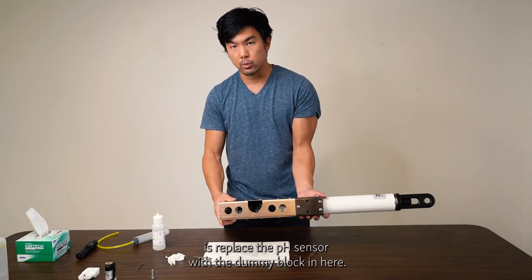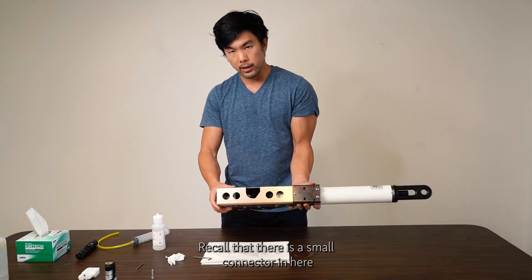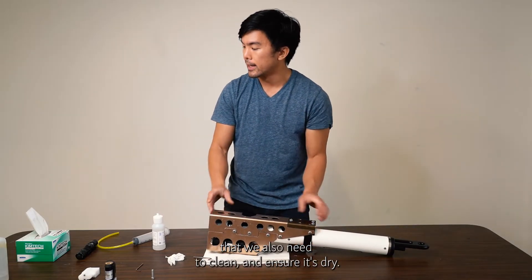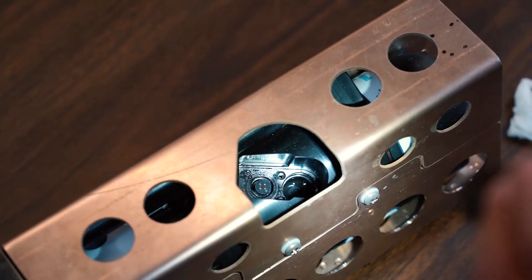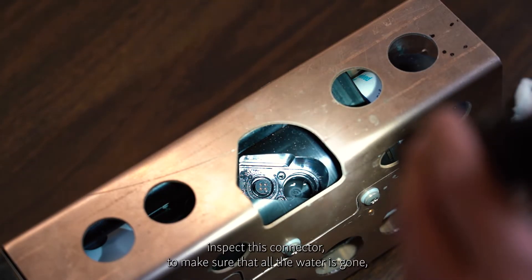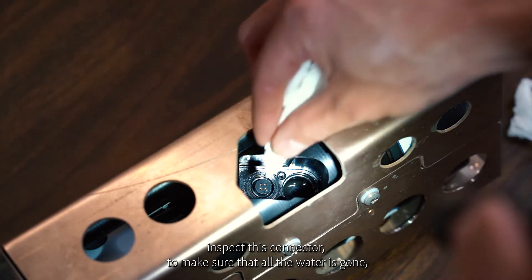The last thing we need to do is replace the pH sensor with the dummy block. Recall that there is a small connector inside that we also need to clean and ensure is dry. Take another lint-free wipe, and use a flashlight under good lighting to inspect the connector and make sure all the water is gone.